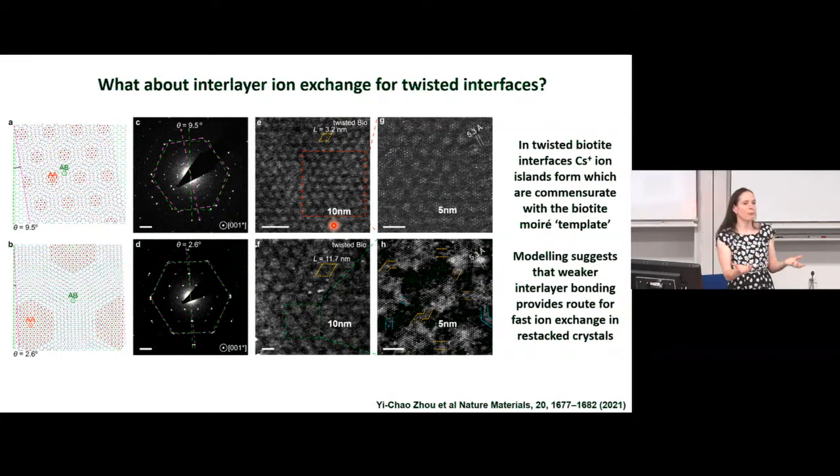And that's a big problem with two-dimensional materials in the literature. You exfoliate them and then they stick back together in some random fashion. So that is called a twisted interlayer, because they are very unlikely to stack with exactly the right orientation so all the atoms line up. It's much more likely that they will restack with a twist angle, a little bit like if you throw paper on the floor, they all sit on top of each other, but the papers tend to be at different angles.